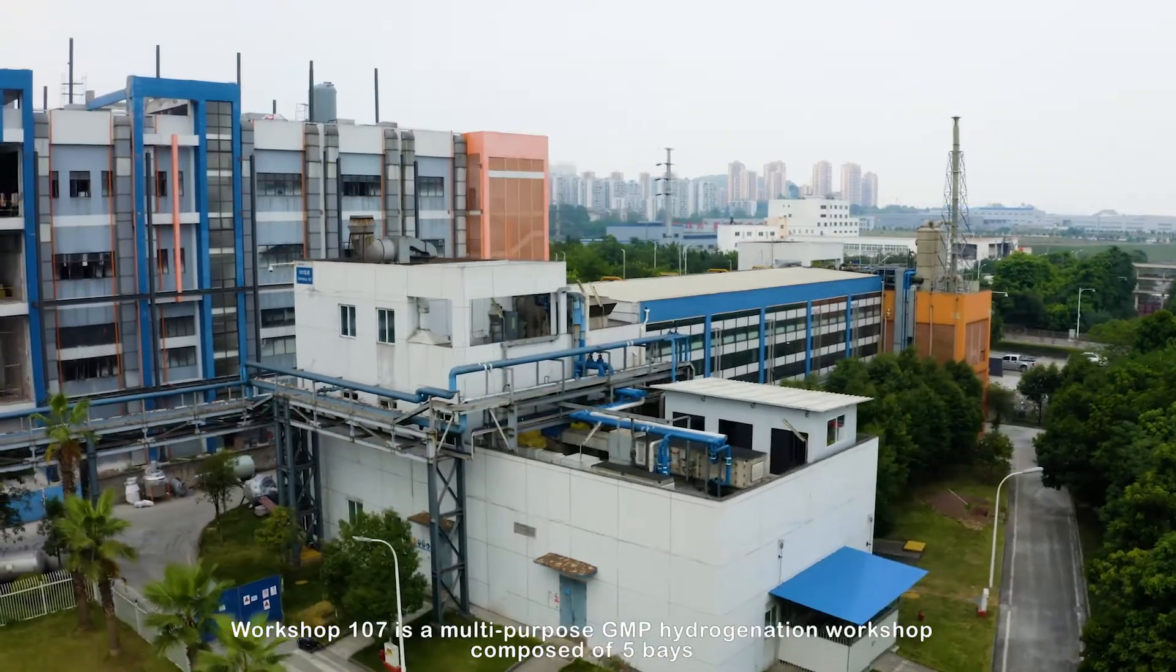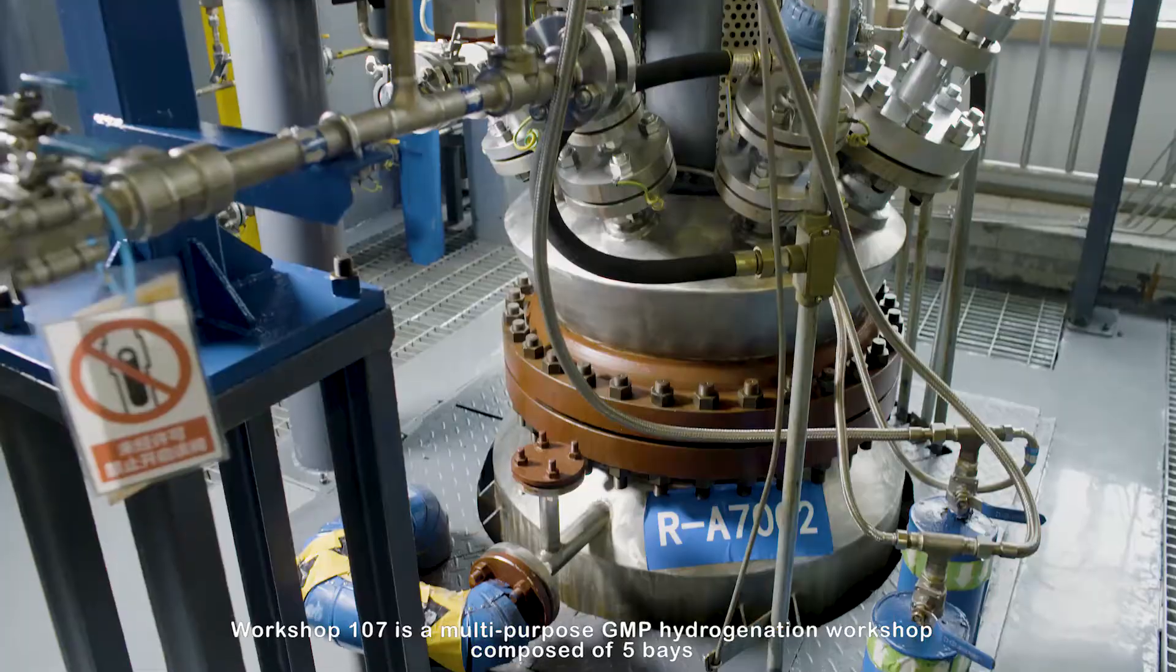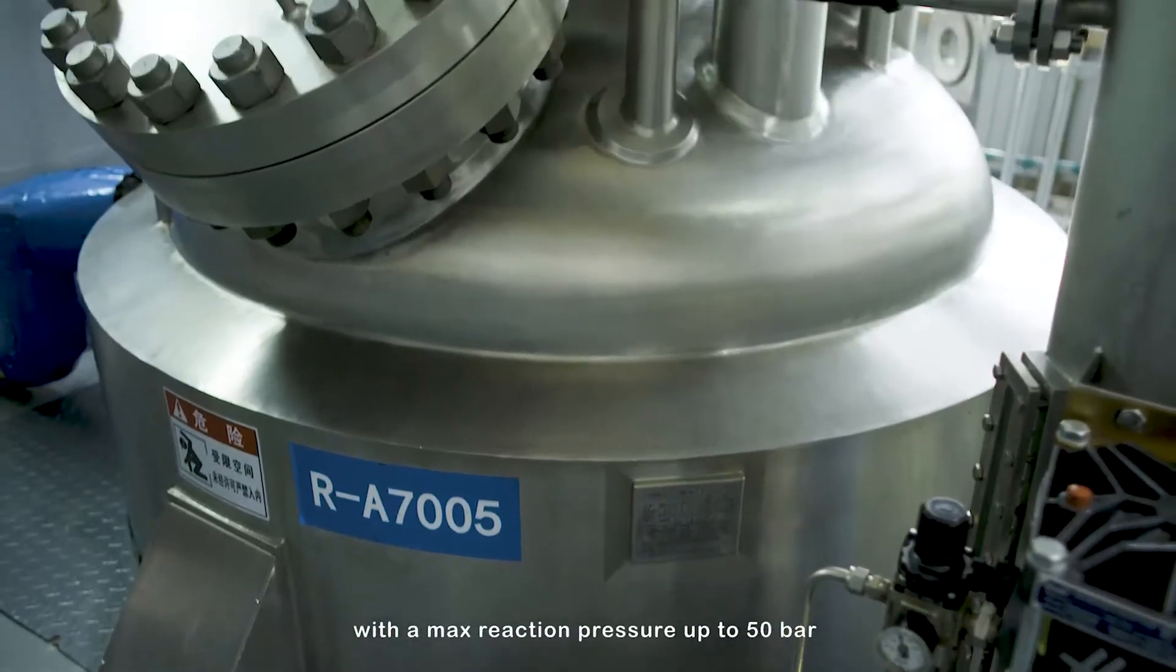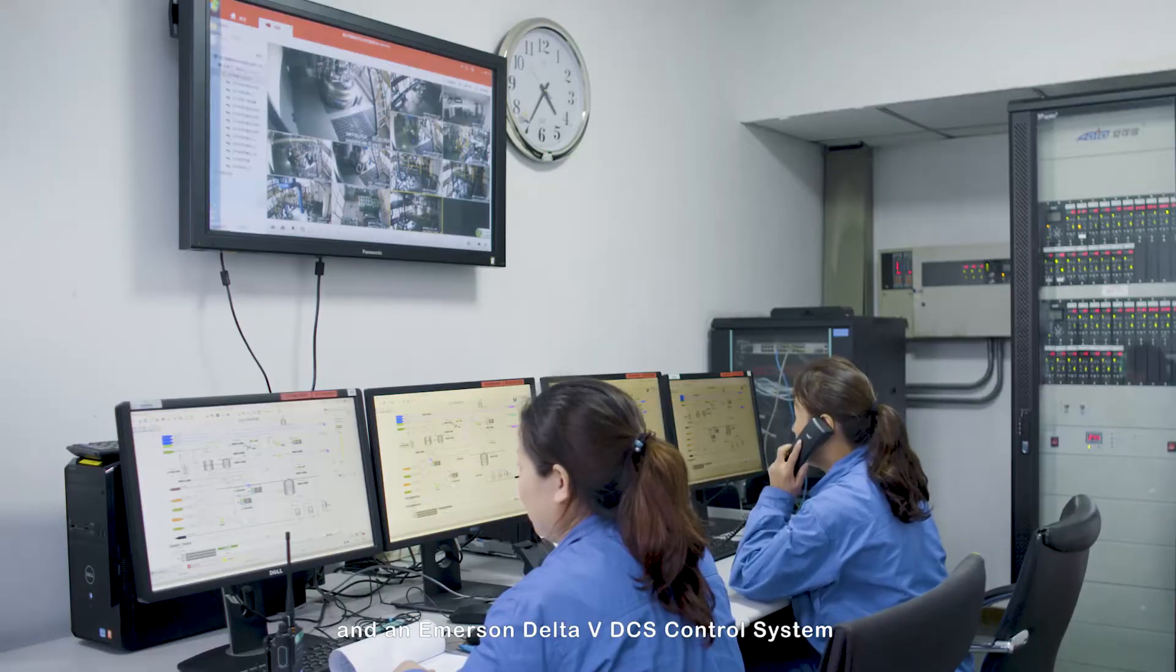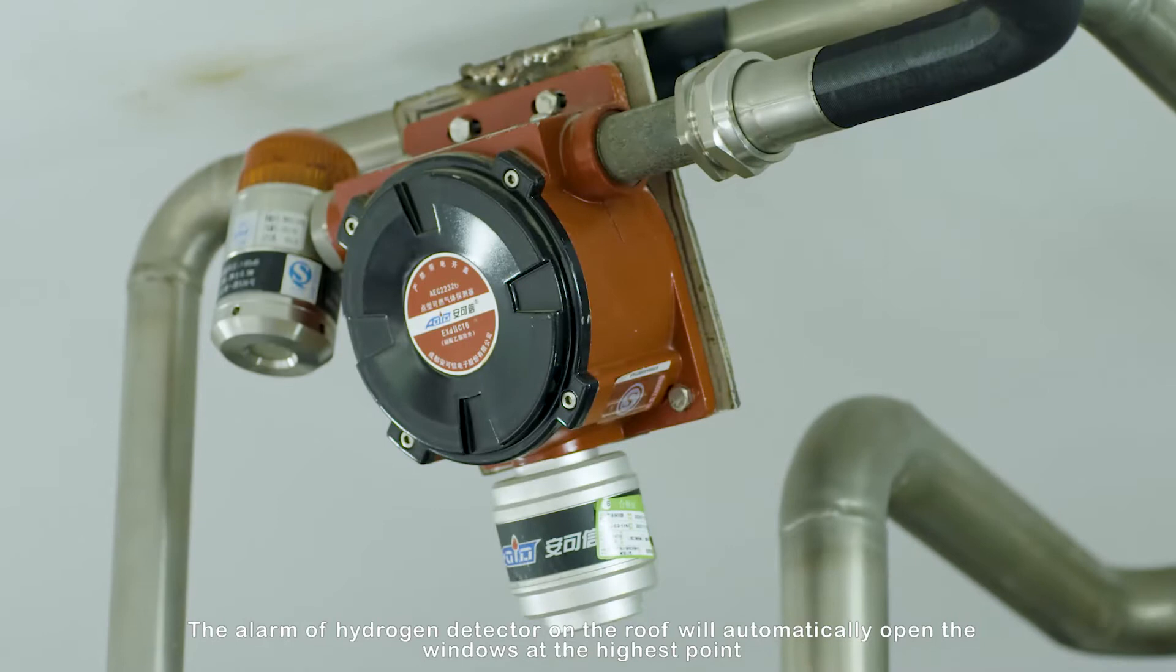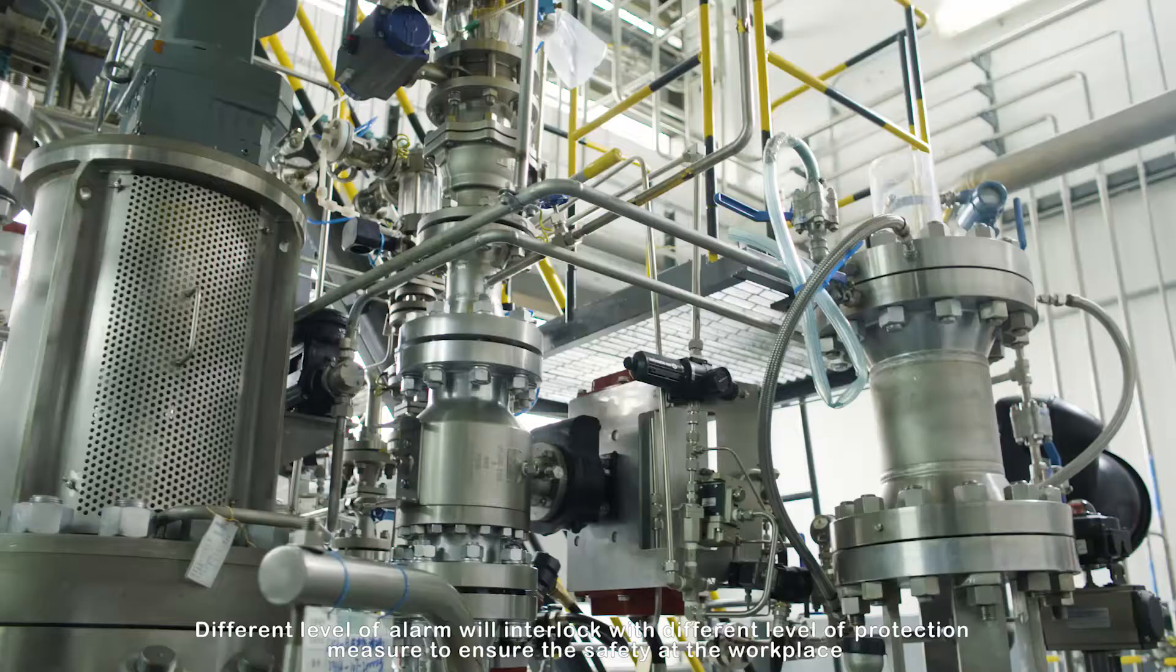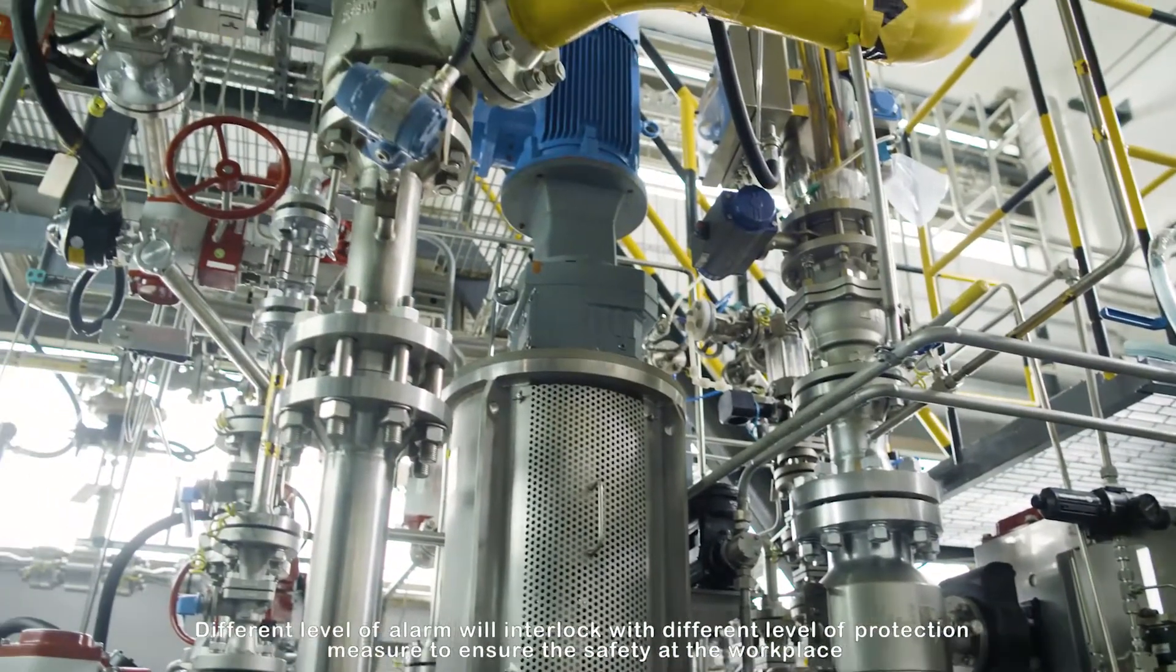Workshop 107 is a multi-purpose GMP hydrogenation workshop composed of 5 bays, equipped with multiple 200-liter to 5,000-liter hydrogenation reactors with a max reaction pressure up to 50 bar, and an Emerson Delta V DCS control system. The alarm of hydrogen detector on the roof will automatically open the windows at the highest point. Different level of alarm will interlock with different level of protection measure to ensure the safety at the workplace.